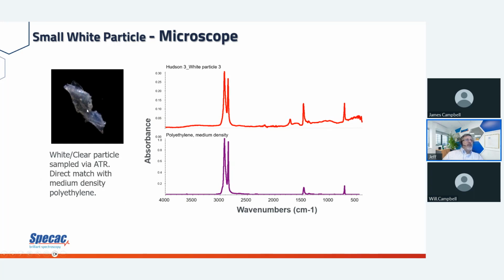You can take that black speck, and this could be the black speck that was in there. And you can find out, geez, all of a sudden we have a piece of rubber in our material. Why is that? We did a little analysis of that, and we found out that earlier in the process, an O-ring broke down, fell off, and dropped into the polymer, and it came out. And we found out, oh, that's what it is. We found out that there was a problem earlier in our process that we had to correct. And they were able to save a whole batch of polymer that they were working with by just one little O-ring they were able to find.